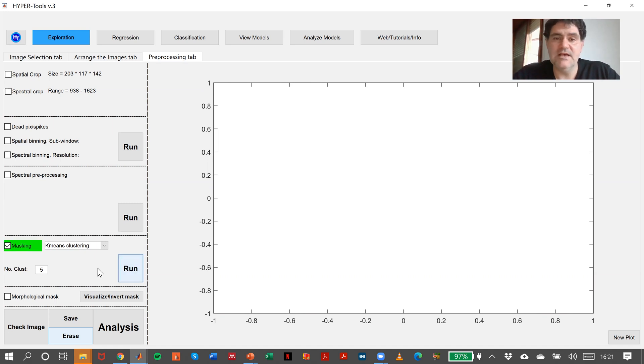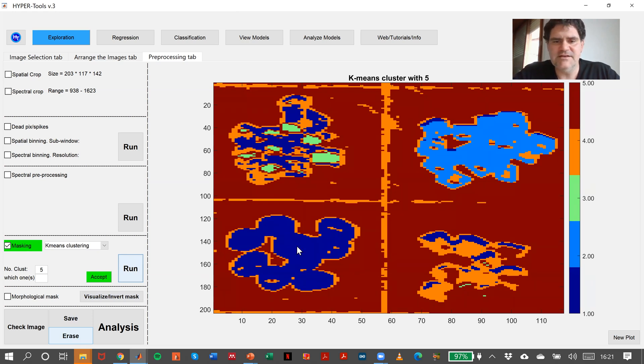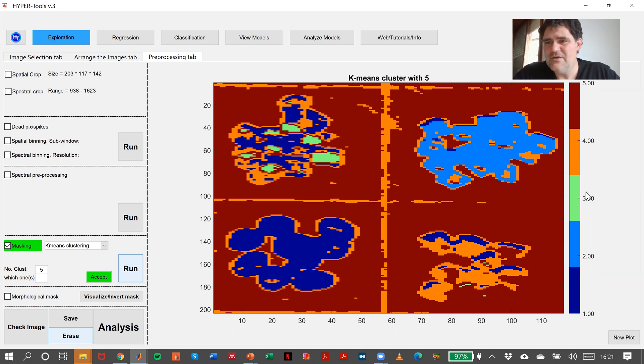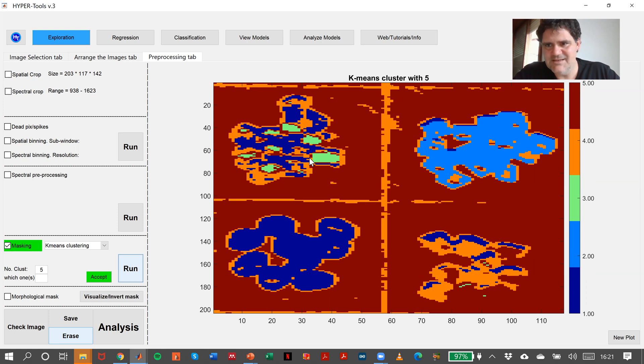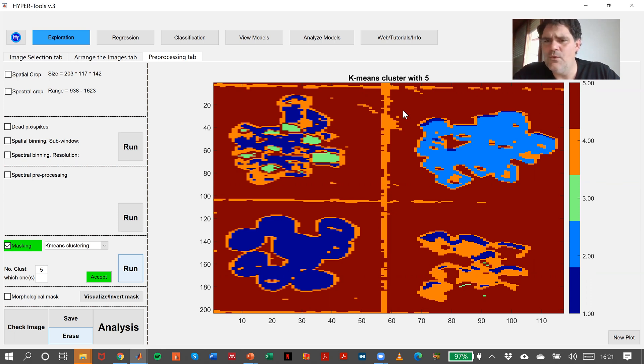It takes a while. It makes clustering on the scores of the PCA model. Look at this. The first cluster is this plastic, plus a little bit of this plastic, plus a little bit of this plastic. The second cluster is this plastic. The third cluster is basically also here, this plastic.